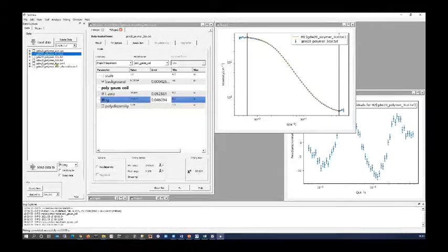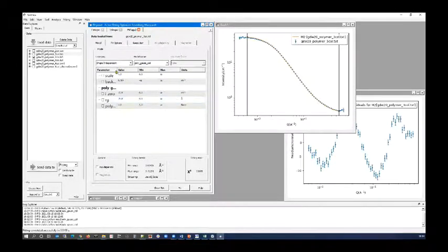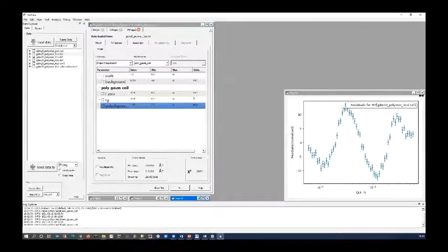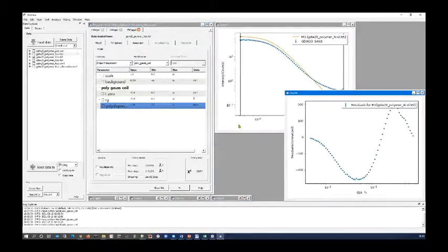I've got several options. I can pick any one of those files there. They've all got the same data in, remember, they're just a different version of it. I'll use the hierarchical one, why not? I'll send that to fitting, creates another fit page. I'll recreate my model again. Put my prior in. Let's minimize these. Show the new data set.